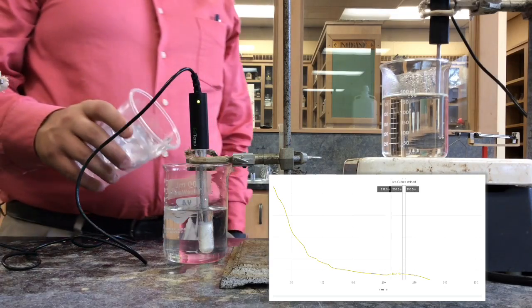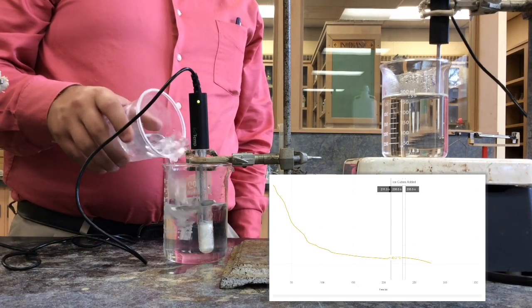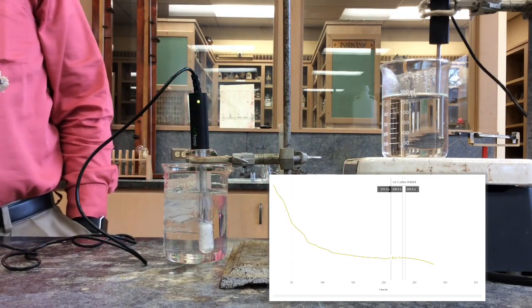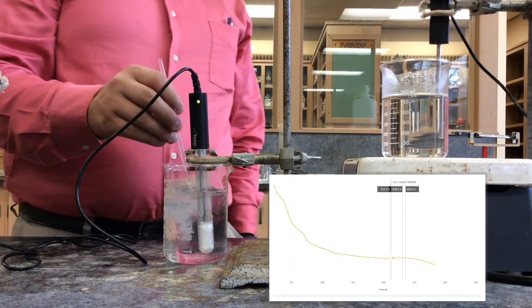I'm going to continue adding ice cubes. I'm going to add a whole bunch. And then I'll use my stirring rod to make sure that it is evenly distributed.